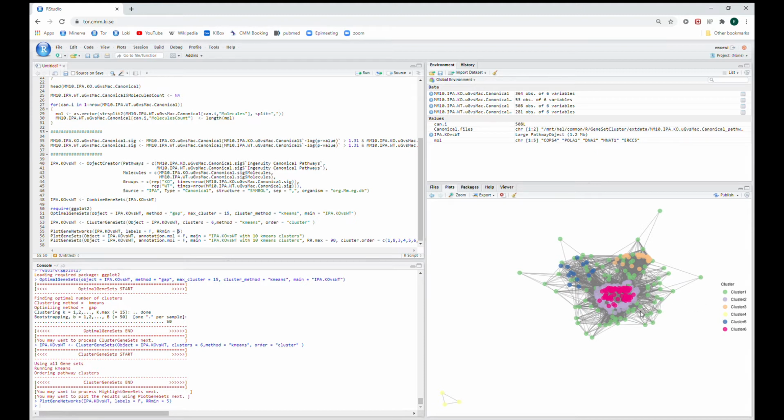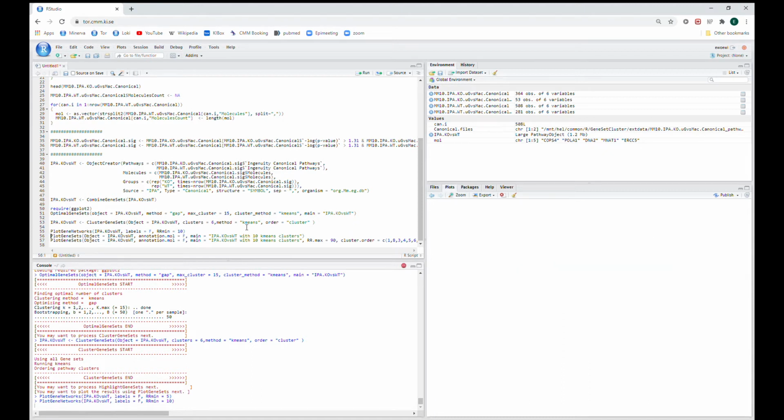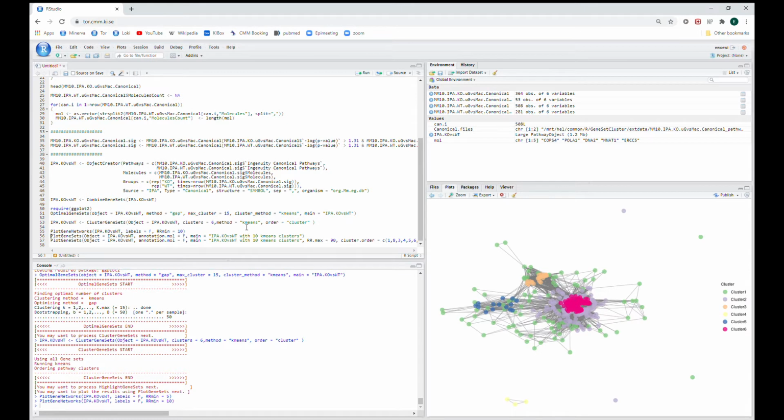In this case, what we can see is that pink or reddish is in the center, surrounded by purple, surrounded by green, with a cluster of blue and a cluster of orange, and there's this little yellow box separate. If we try, well, what if there's a minimum of 10 relative risk between them? Then it's going to draw much less lines because the threshold is much higher. And therefore, the number of connections will be more limited.